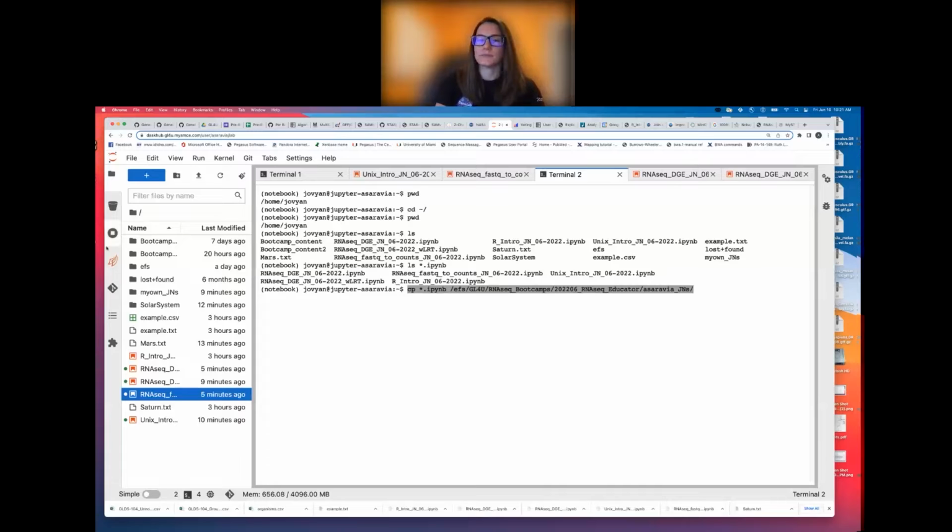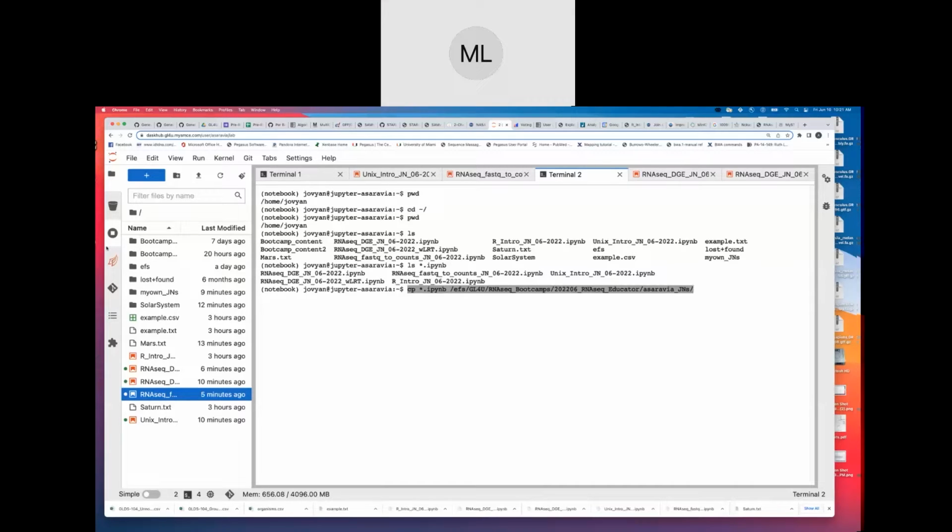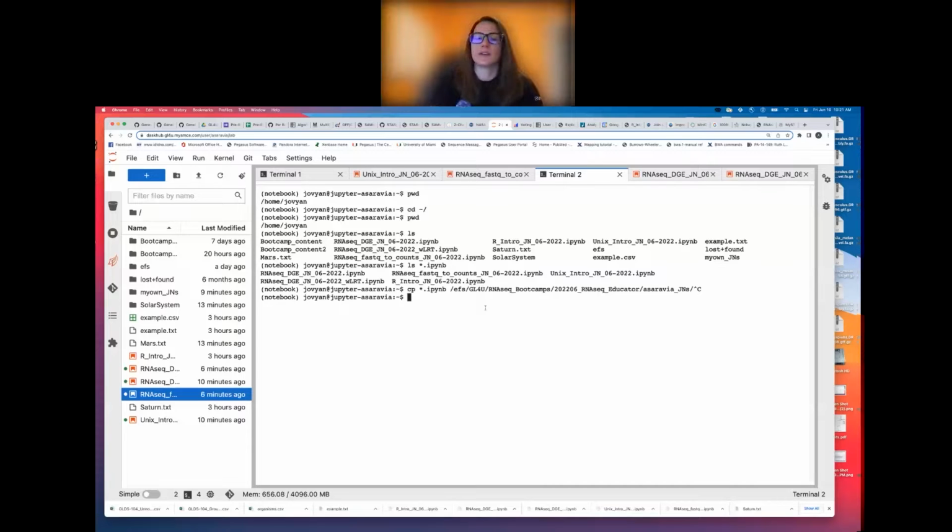Hey, Amanda. Why don't you run ls on that root directory and everyone can see their names as they're written in there? Oh, that's a good idea. Okay. So if we take a look, I'm going to add an option to ls to list everything in a single file.